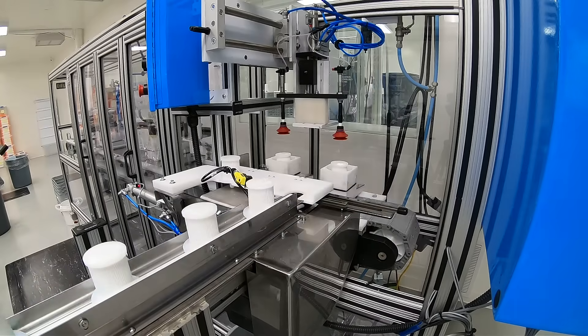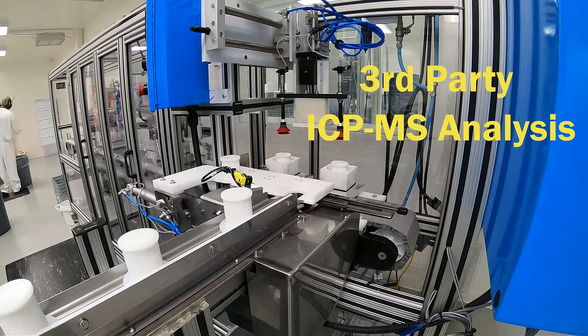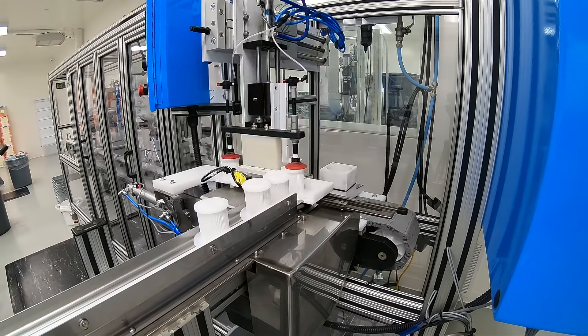Watera uses independent laboratories to provide third-party analysis. This ensures that all of our filters are ultra-pure and not going to affect your analytical results.